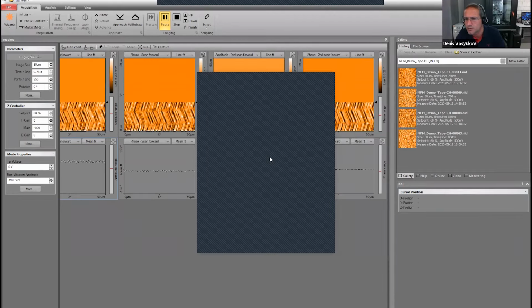Yeah, there is a question. For hard magnetic materials, interactions with the tip are strong; can the MFM measurements then be correctly interpreted? Well, yeah, that is a question. It's hard to answer without seeing the image and without doing a micromagnetic simulation.